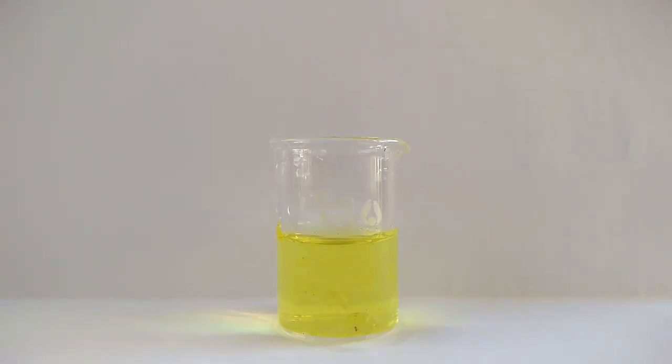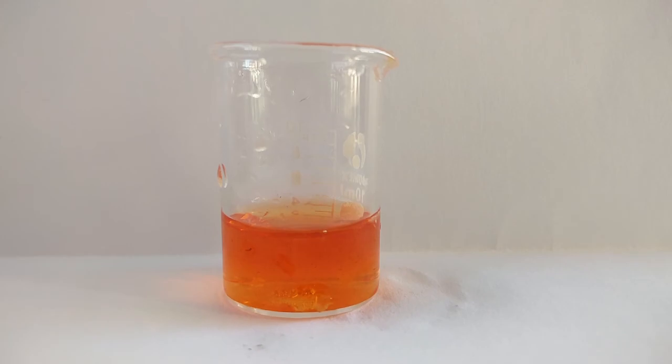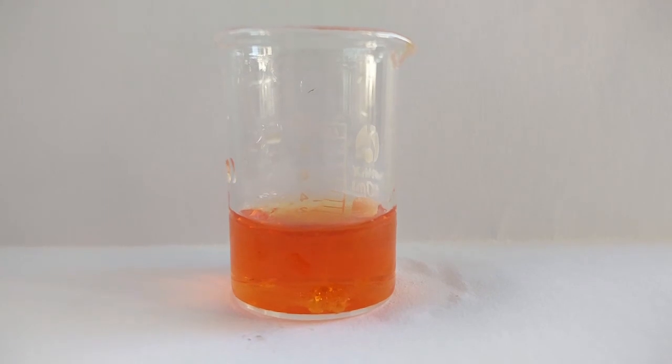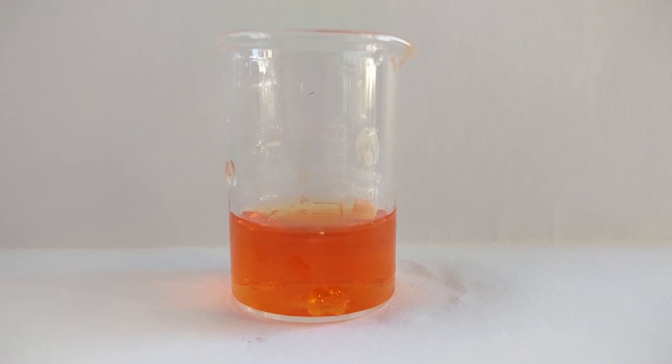You see the result of a nitrite test which was used on the nitrate solution. As you can see by the yellow color there is no nitrite in here. This orange-red solution is the result from a nitrite test from our product solution. The concentration of nitrite is very high in here. Do you have any ideas how to get rid of the magnesium acetate? Let me know in the comments. Keep doing chemistry.